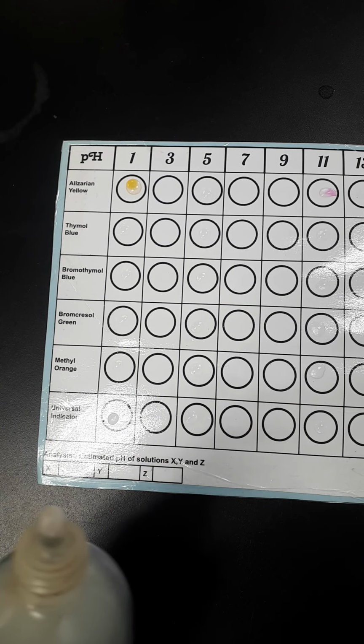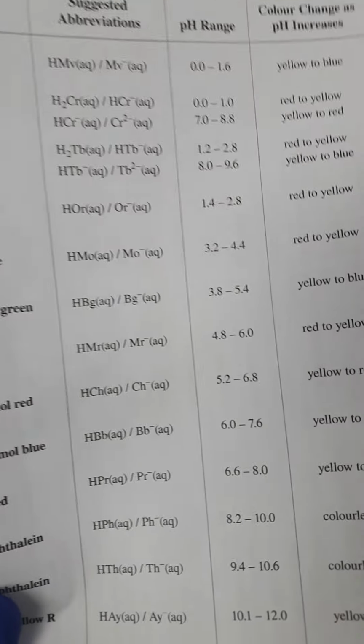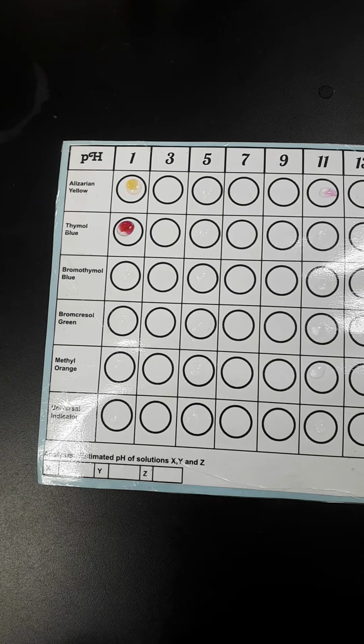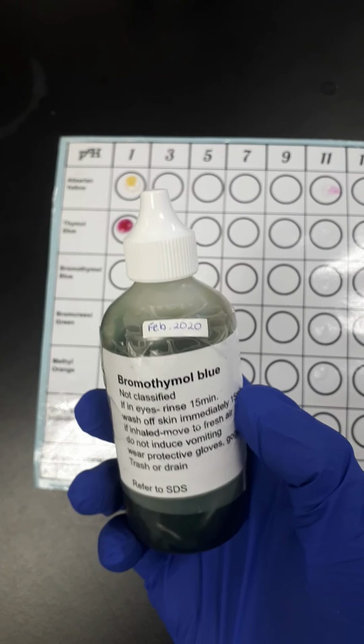Let's check out what happens with pH of 1 with thymol blue. First, let's make a little bit of an estimate here. So pH 1 with thymol blue. If it's less than 1.2, it should be red. Let's check it out and let's see if it's actually red. Very nice. You're talking to a colorblind guy here, remember that? So I think it's red. Should be red. Looks red to me. Okay, let's check out bromothymol blue.